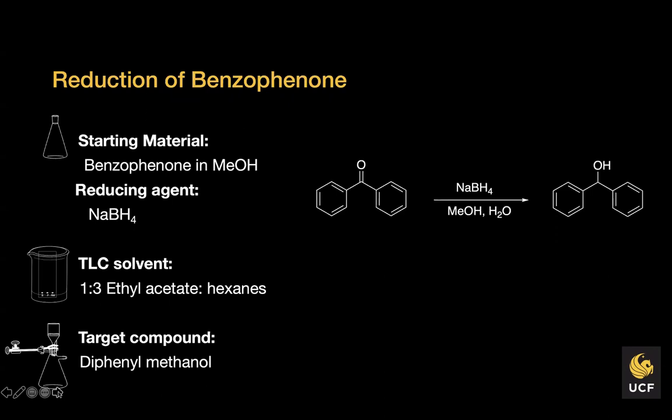And then to monitor the progress of the reaction, or whether the starting material has been fully converted into product, we use a new technique, which is known as thin layer chromatography. It's new in our lab. This is the first week you encountered it. So today's Zoom session, I guess, will focus on using TLC. And then we used vacuum filtration to retrieve the target compound, and it was characterized using IR.